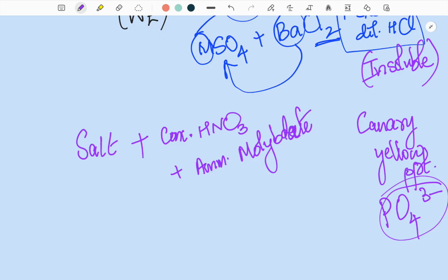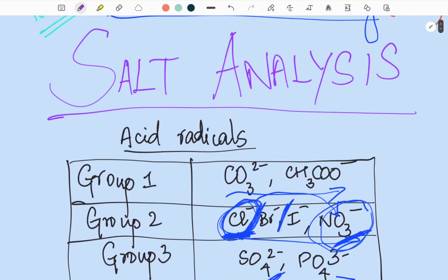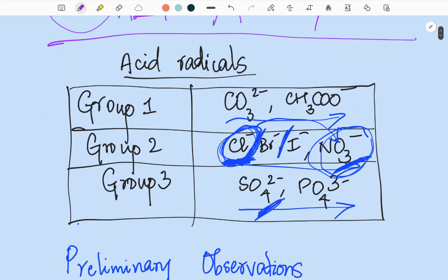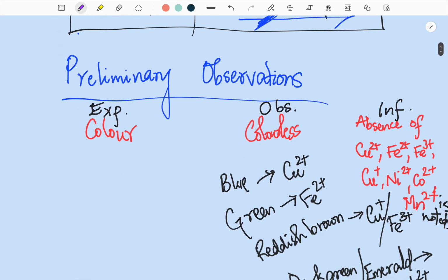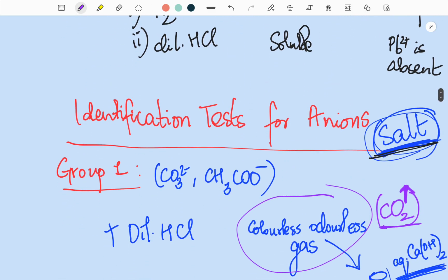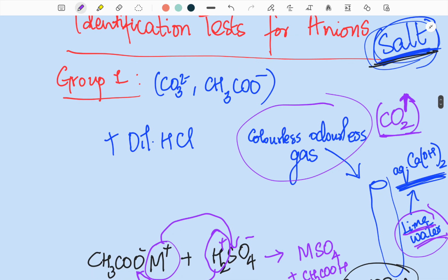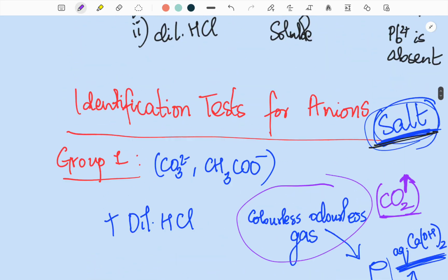So in this video, that is all I'm going to explain. We discussed the classification of acid radicals. Then we discussed the preliminary observations in salt analysis, and we did one of the major headings in salt analysis, that is the identification or systematic tests for anions. And I will just summarize everything quickly.